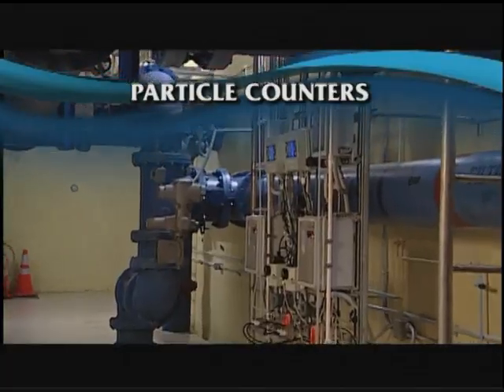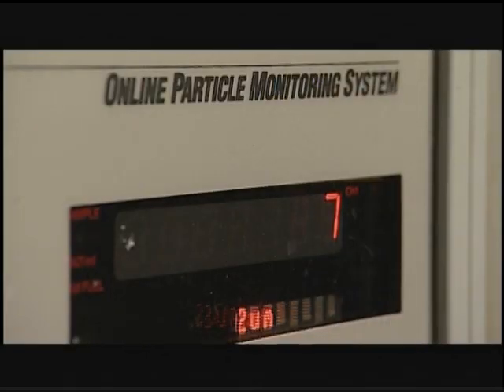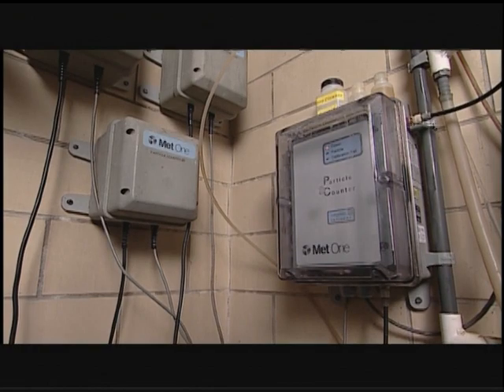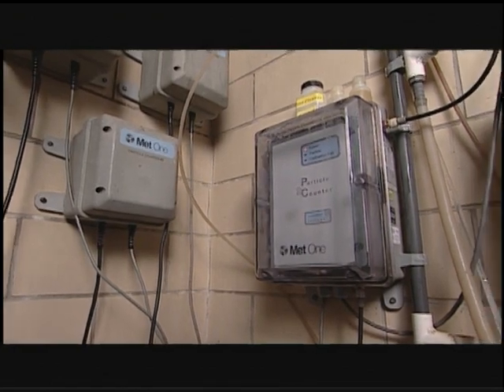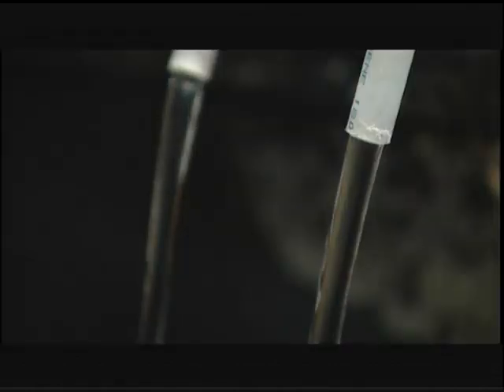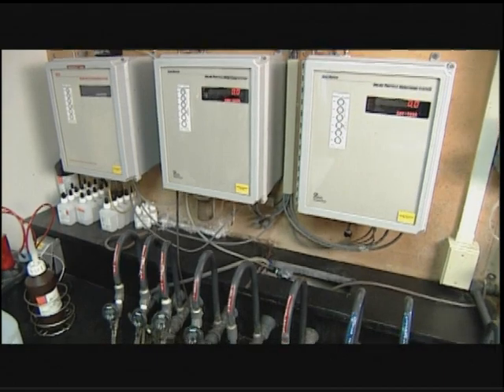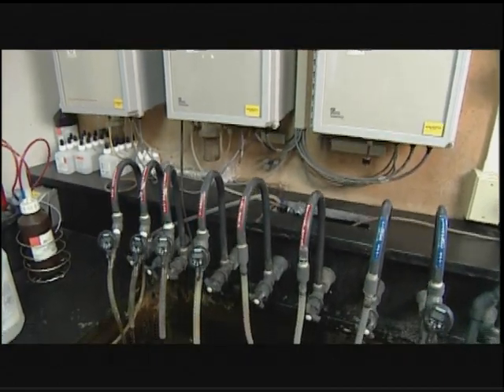The instrument used by water providers to size and count particles in water is the particle counter. Particle counting has been long used in medicine, manufacturing, and electronics, and is today a valuable tool for water supply operators.